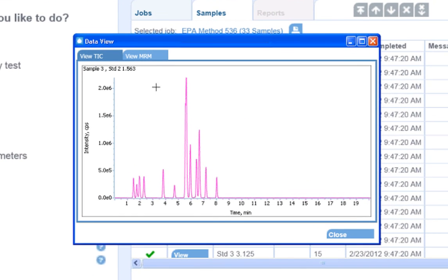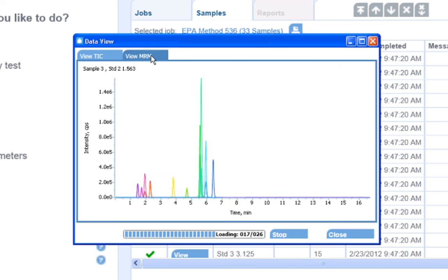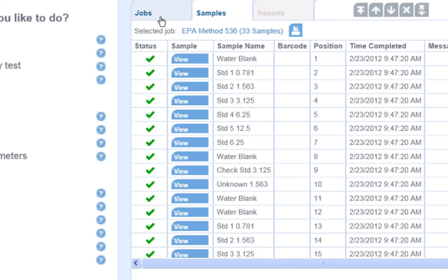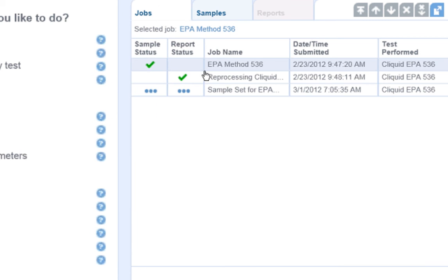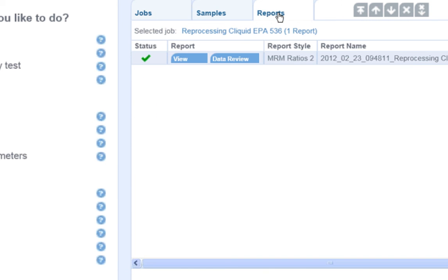I can either view the TIC or individual MRMs. Clicking the Reports tab will give me access to the quantitation reports generated for that sample set.